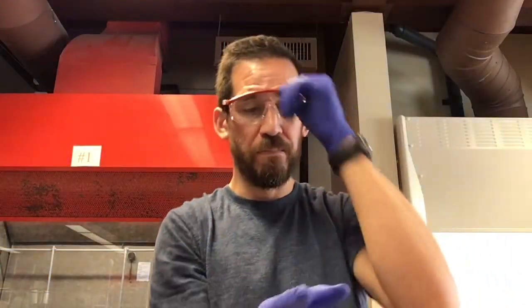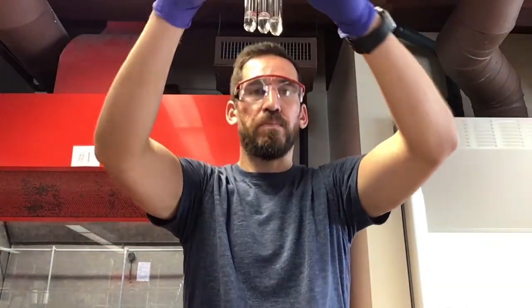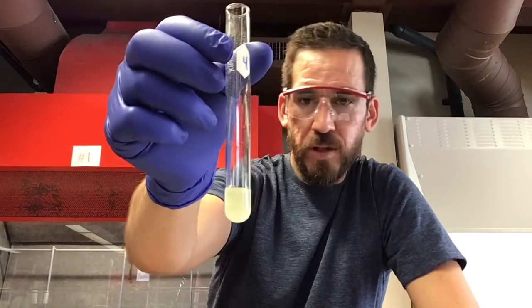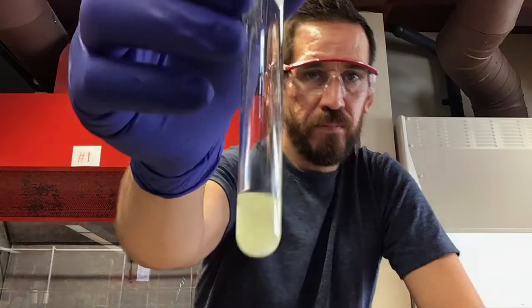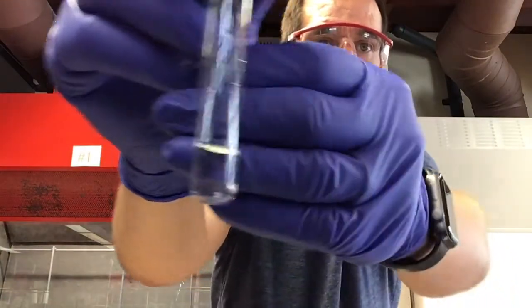All right, so here's the thing. I'm going to run it back one more time. So here's 1, 2, 3. Seemingly no precipitate. So I'm going to set those aside. Here's number 4. Hopefully you guys wrote this down, but it is 1-bromobutane. Do you think that looks like a precipitate? Okay, cool. So do I. Number 5. Doesn't look like anything. I'm going to go ahead and set that to the side.